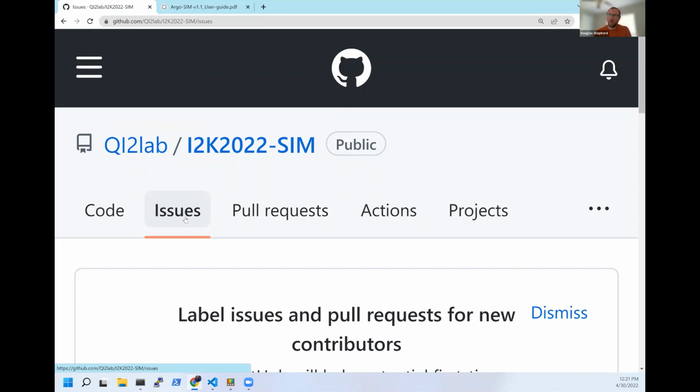And then what we'll try and do is have things set before the GatherTown, if people look at this before then, and then we'll be available on the GatherTown to troubleshoot installation and downloading it. And if anybody has issues with using a pickle file on their computer, then we can provide that in an alternative framework. I will talk with Peter about getting that data set done such that it can be loaded correctly.